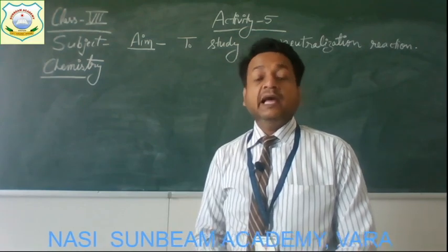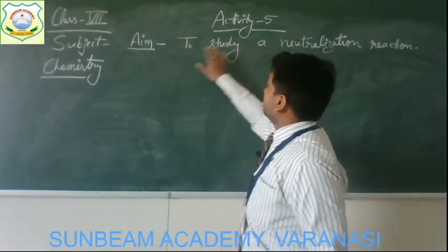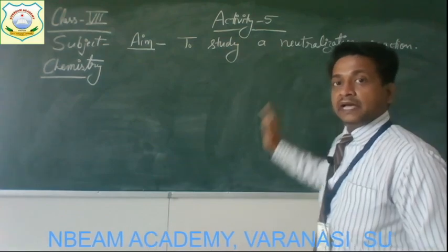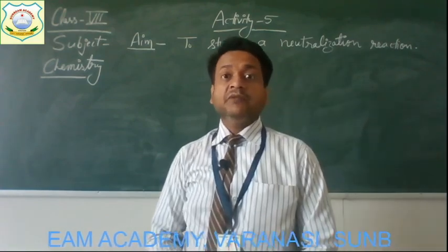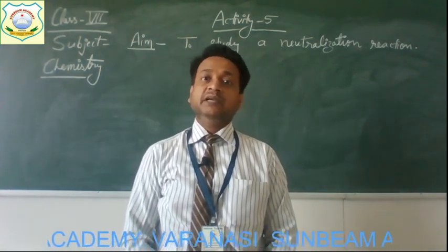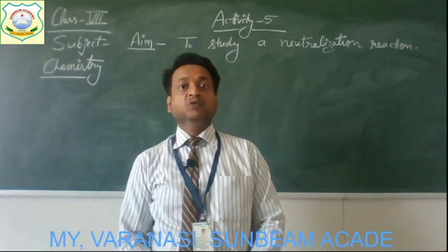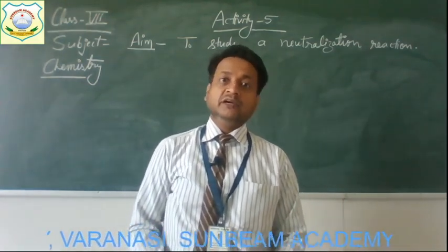Alright children, the aim or objective of this activity is to study a neutralization reaction. Remember that we have discussed the neutralization reaction in the chapter acids, bases and salts. So here I am going to demonstrate this reaction.